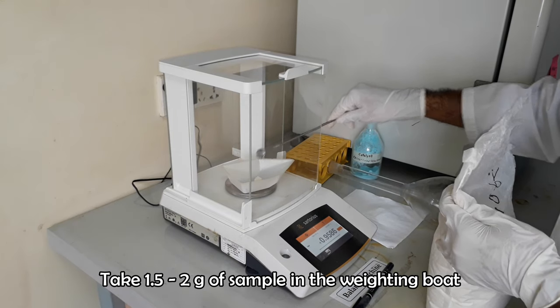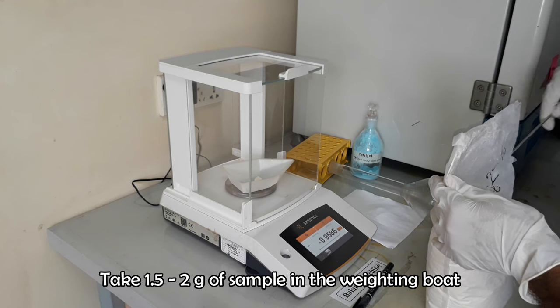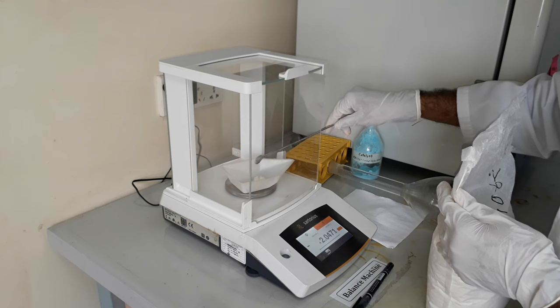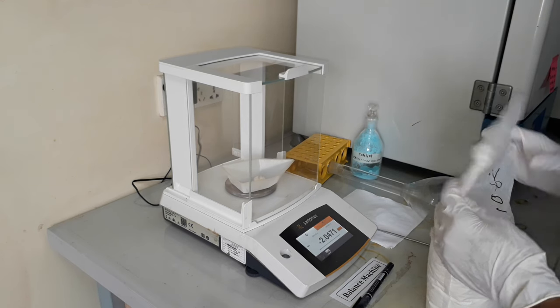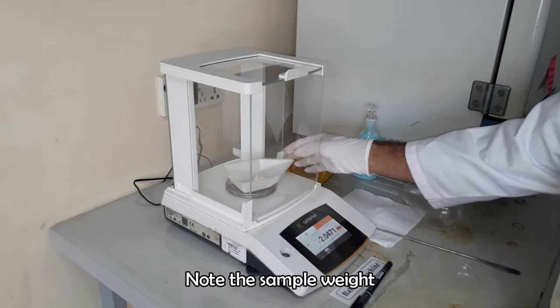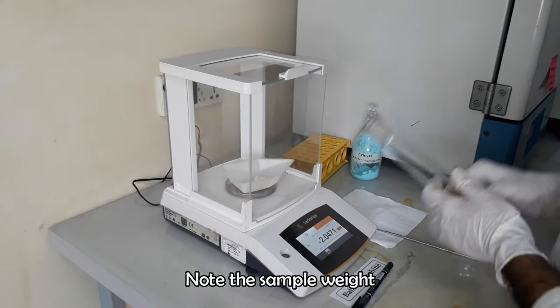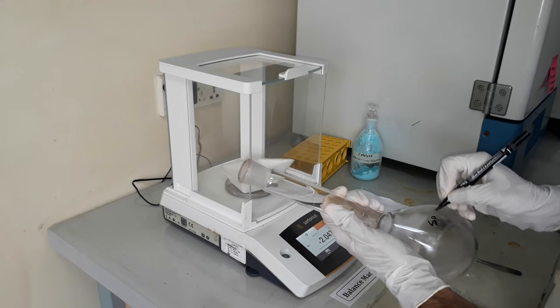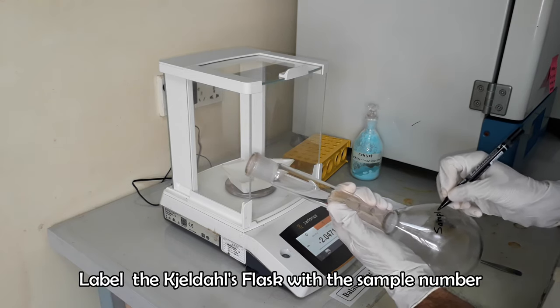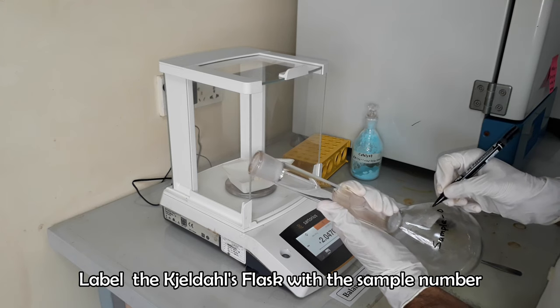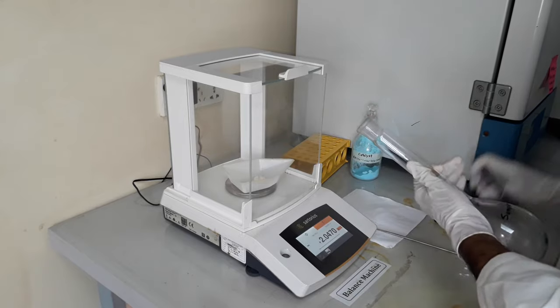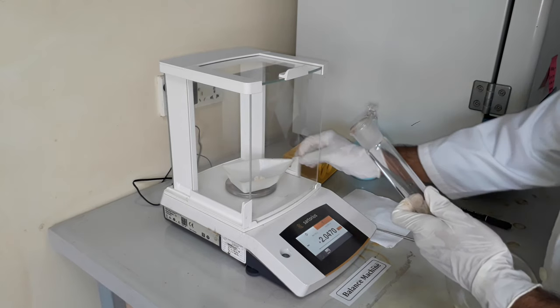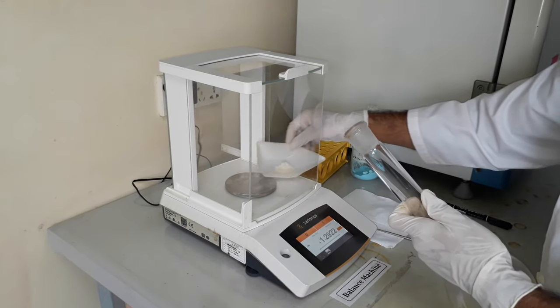Weigh 2 grams of homogenized portion of sample in a weighing boat. Label the Kjeldahl flask with sample number or sample ID. Add the weighted sample into the pre-labeled Kjeldahl flask.